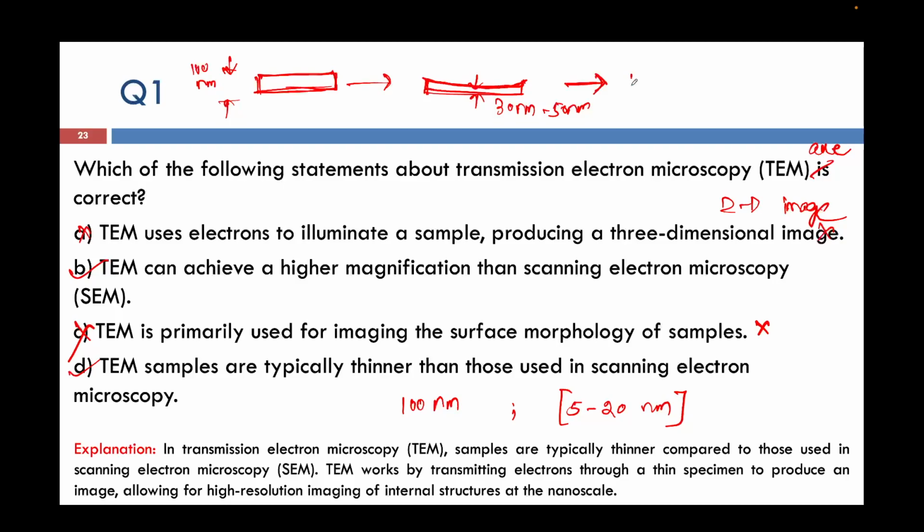Through that, a small hole will be created. Around this hole, the thickness will be close to 5 to 20 nanometers.